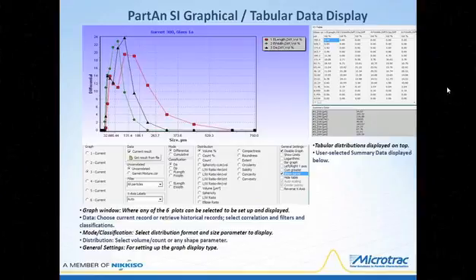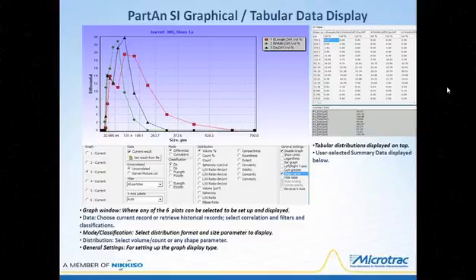The three windows shown are contained in the Partan 3D's XY display window. The XY graph in the upper left can display up to six different size parameter distributions. Here we're showing only three — length, width, and area equivalent diameter — on a volume percent logarithmic distribution for a garnet sample. Any of the 32 parameters can be plotted and listed in the table to the right. Up to six different historical records for one parameter can also be overlaid for comparison. The window below the graph is where the graph can be set up, and on the left, any of the six plots can be selected for setup and display.